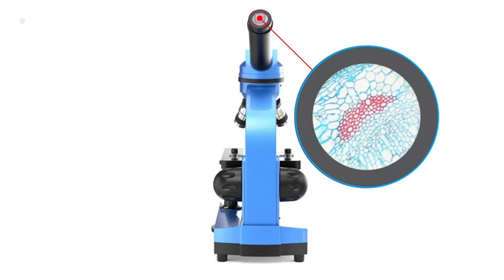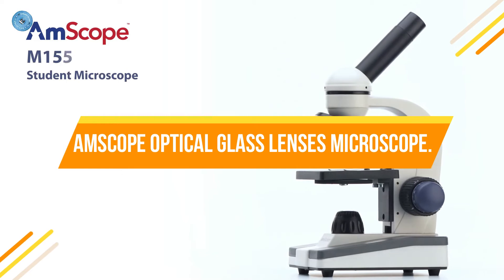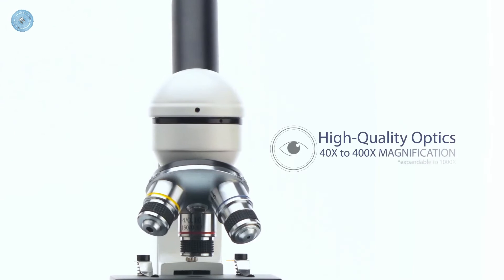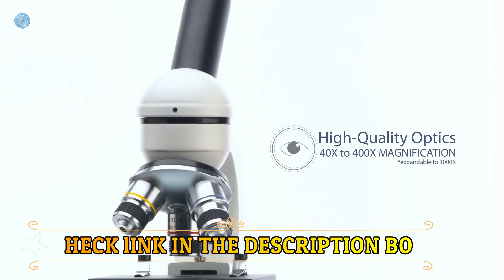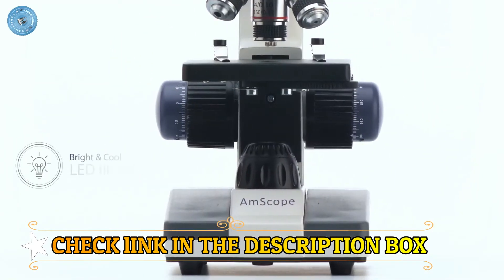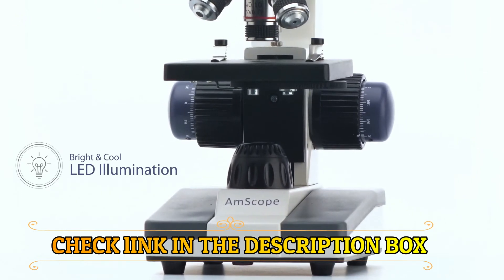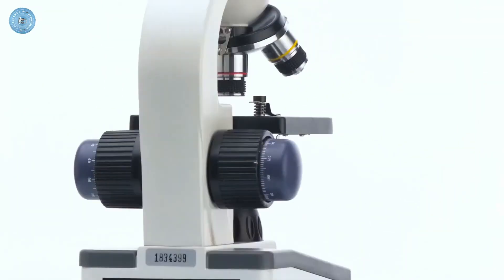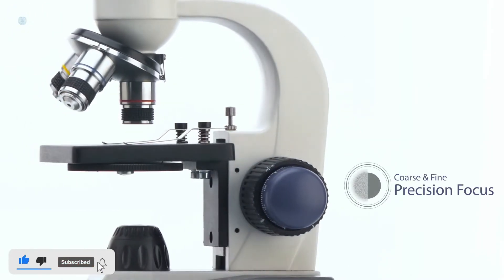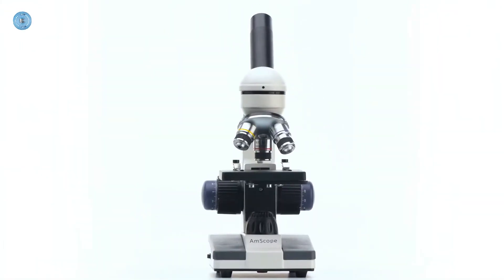Number 3: Amscope Optical Blast Lenses Microscope. This is an ideal microscope for homeschool or for students from elementary to high school learning sciences. The 360-degree rotatable monocular head offers 5 magnification settings: 40x, 100x, 250x, 400x, and 1000x. Wide-field all optical glass elements include a single-lens condenser with disc diaphragm. Sturdy all-metal framework. Power supply: 110V LED illumination system using either an outlet (adapter included), 3 AA batteries, or rechargeable batteries.